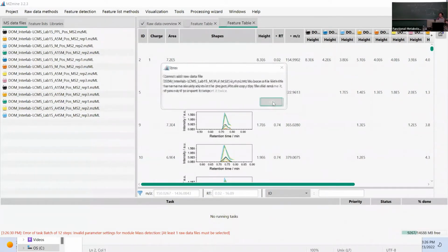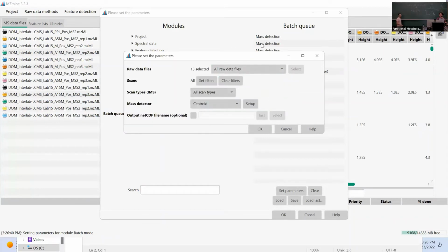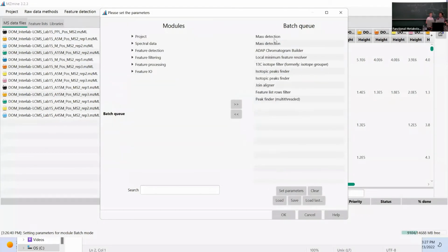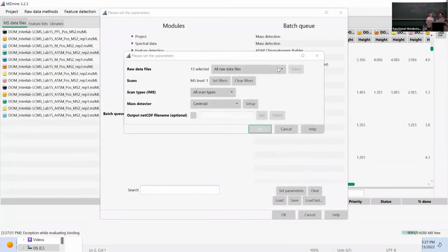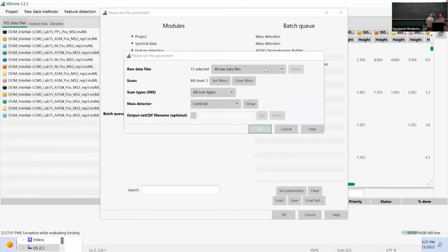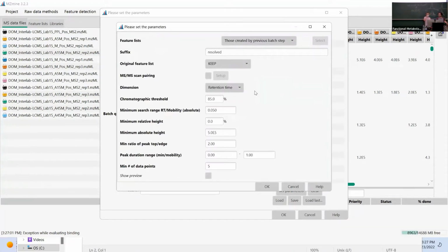Oh, wait. Did I? Oh, my God. Why didn't I kick it out? I only told you to kick it out. All right. Okay. So all raw data files. Okay, so I hope you were better than I was.